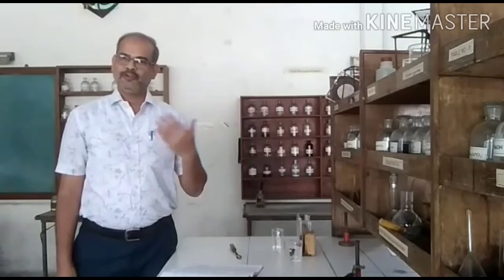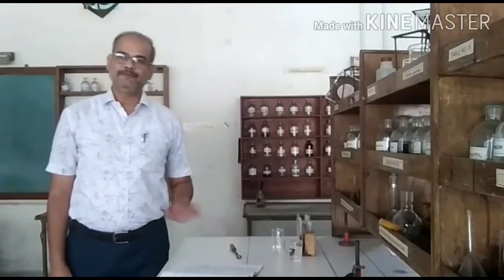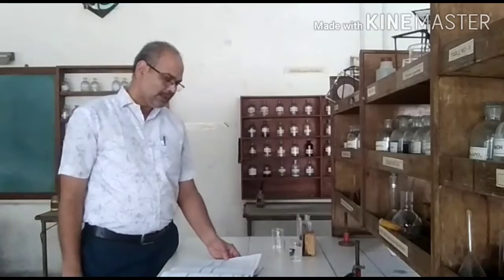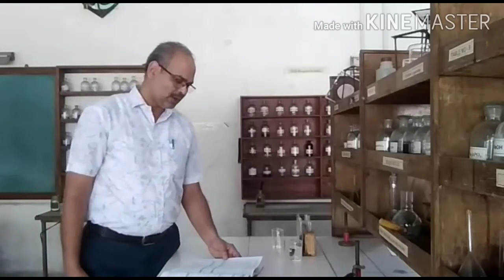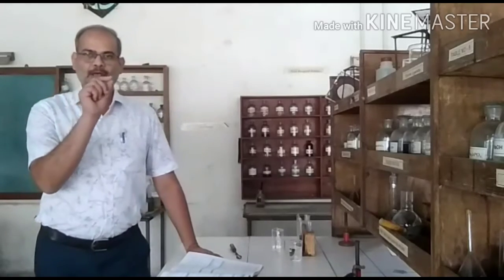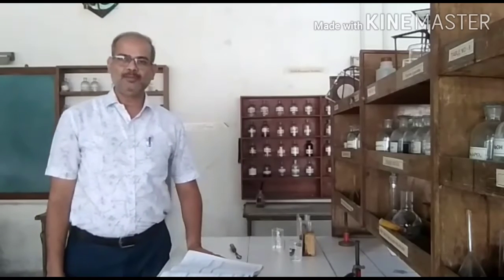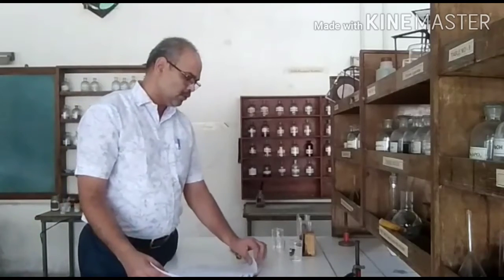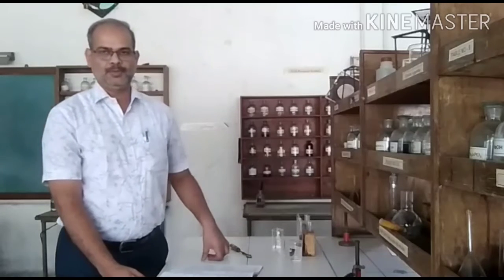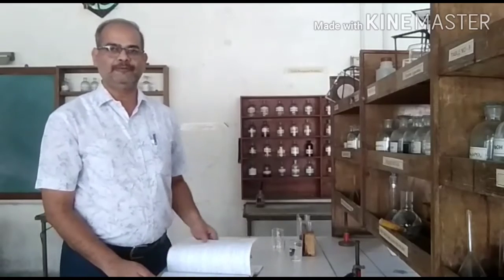So in the second video, we detected the two acidic radicals, and in this third video, we have confirmed the two acidic radicals. Come to page number 94. Capital E. Confirmatory test for acidic radicals. Number 1. CT for first detected acidic radical. Further, they have put a dash. What you will write there? Carbonate. In the bracket, you will write CO3-2. Test number 1. What is the test of carbonate we have done? OS plus 2 to 3 drops of phenolphthalein indicator. What is the observation? Pink color. What is the inference? CO3-2 is confirmed.